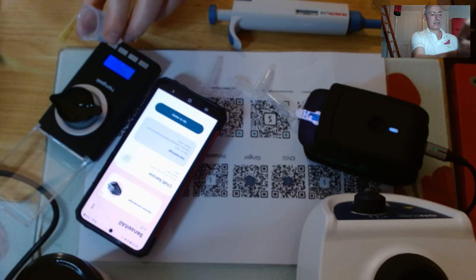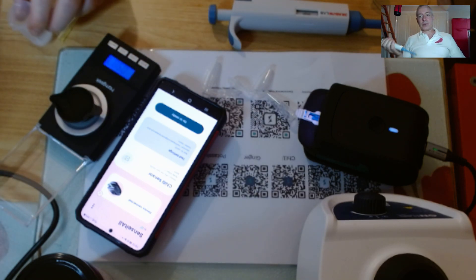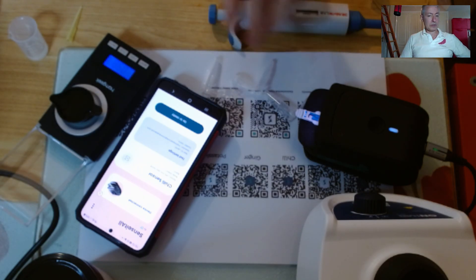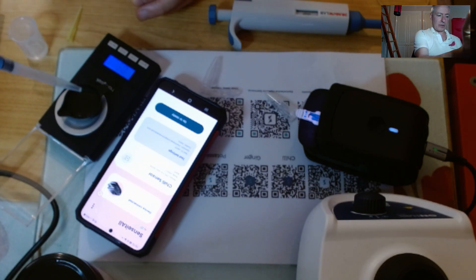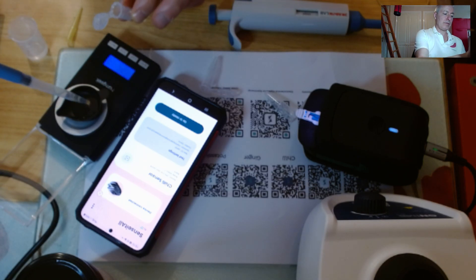I'm sort of counting in my head at the same time as I do this, so I hope I don't miscount. I did that that way because that was the pipette that I actually had on me. So what I will now do is transfer it into a little vial like this. I want to make sure that I get everything transferred across – I might get myself a slightly larger pipette in order to do this. I definitely don't want to leave material behind, because I want to make sure that we actually extract all of the capsaicin.